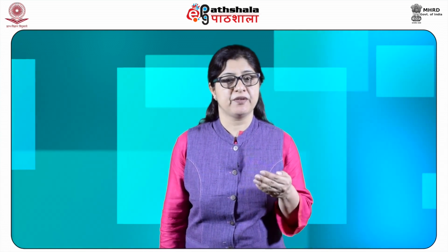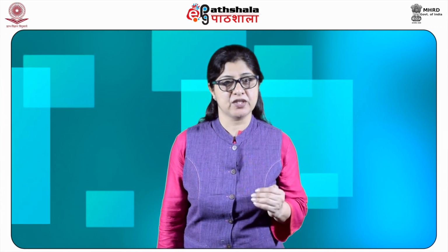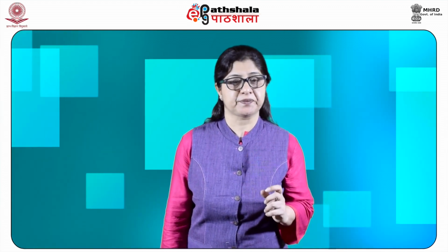The capacity of an ion to undergo exchange reaction has been found to depend upon the charge and the size of the hydrated ion in the solution. Under similar conditions, the capacity has been found to increase with the charge on the ion, that is the valency of the ion, but has been found to decrease with the increase in size of the hydrated ion.